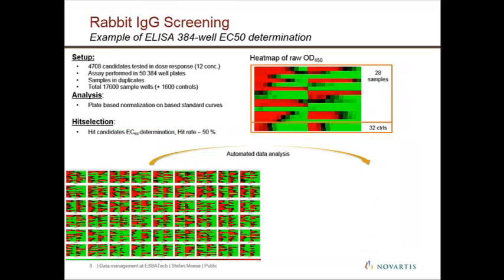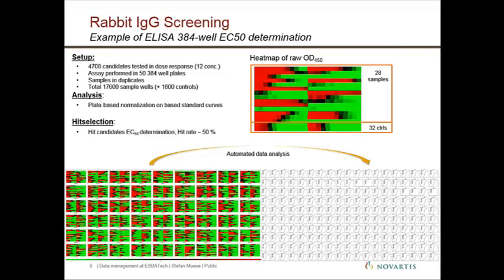And so just to give you an idea, a little bit more detail, what we're doing is this typical example of an assay where we typically run these assays in 384-well plates, and there are different concentrations of antibodies in here. And the assay essentially tells you the more green you see, the better it is, and then you want to get that analyzed. And this is what we do with R, and which we've automated to get the curves out of each of these experiments. And the thing is, all of this stuff was developed outside of the Labkey, of course.